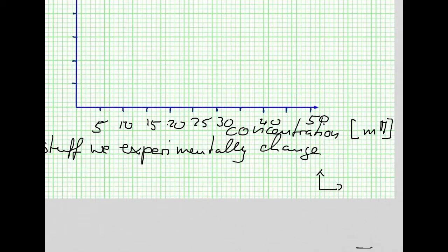Or they start with a graph and then find out, oh, 10, 20, 30, 50. Oh, it doesn't matter, I can do that on the bench. Yeah, you can do that, but then you have to submit the bench. It's a bit inconvenient, right? So plan your graph well.